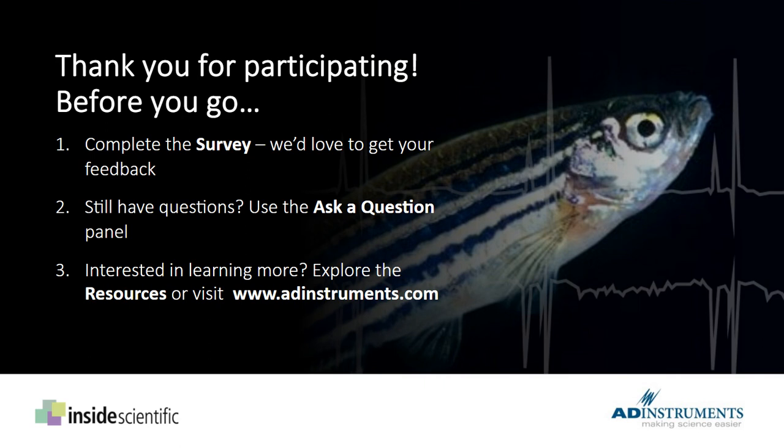The QT was definitely prolonged, that's for sure. But QT prolongation puts them at risk for developing sudden cardiac arrest by developing VT. So we have seen bidirectional VT from, let's say, digitoxin. We have seen monomorphic VT from cryoablation, leading to sudden cardiac death. But polymorphic VT might be a little bit rare for us to see.